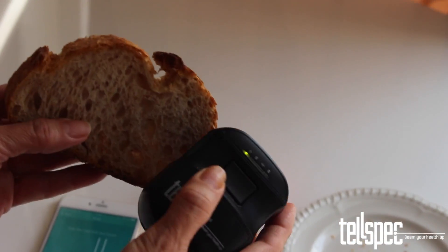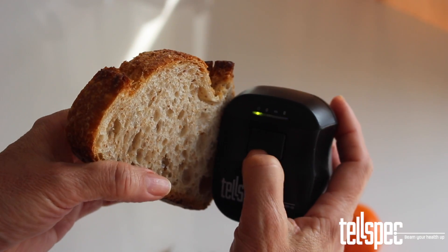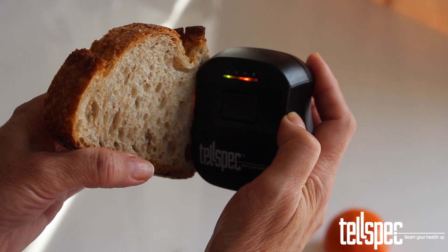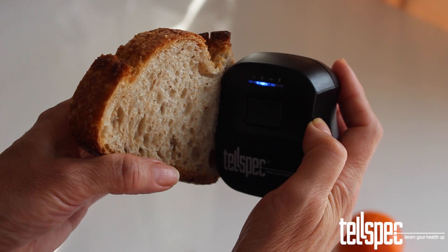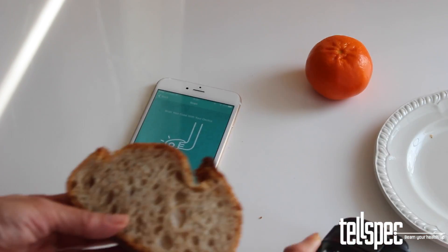Hold the scanner window up to the food and make sure you eliminate as much of the air gap between the scanner and the food as possible. Then press the button on the top for one short press. You will see the scanner light come on and go off again after a few seconds. Keep the scanner in place whilst the light is on, as this is when the data is being collected. When the light goes out, you can remove the scanner from the food.